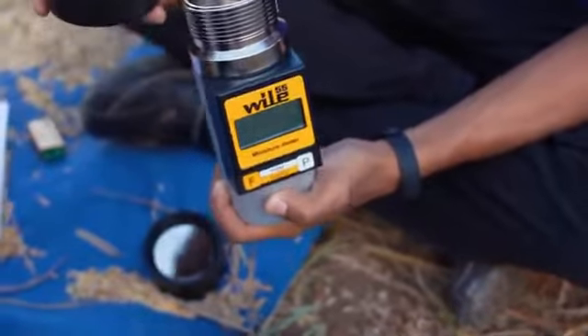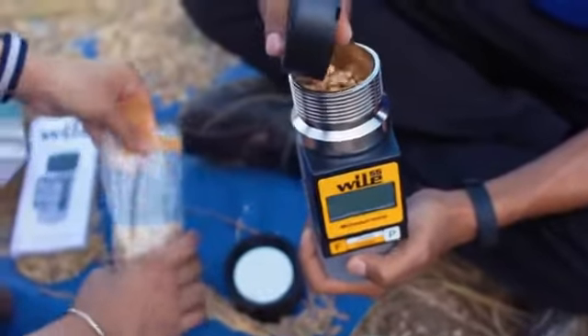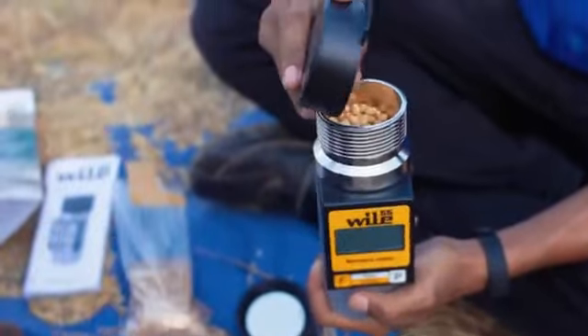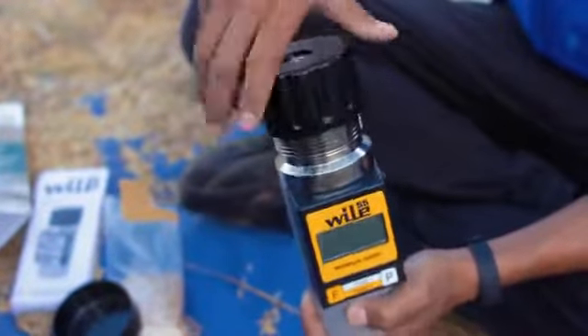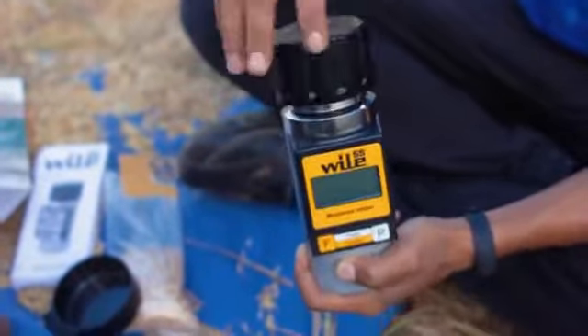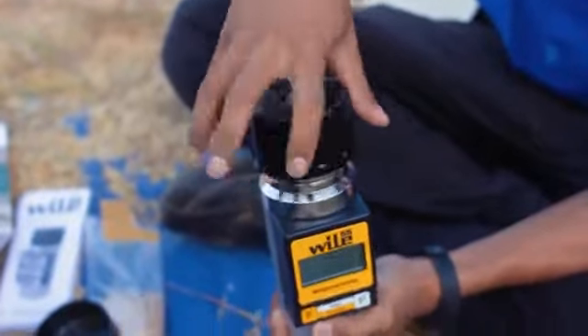Seperti biasa, kita masukkan dulu sampel pada bidang ukur satu per empat. Kemudian kita tutup kembali. Lalu goyangkan alatnya. Kemudian kita masukkan sampel hingga penuh.